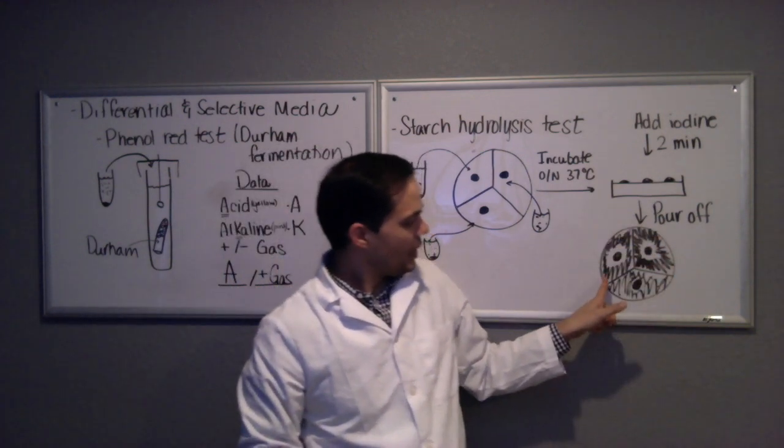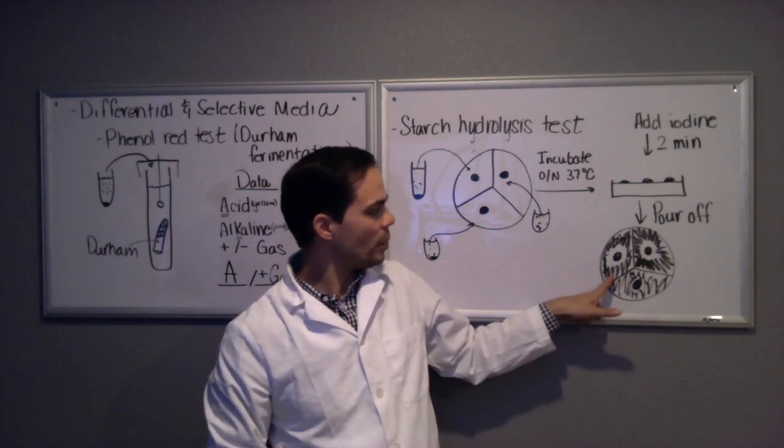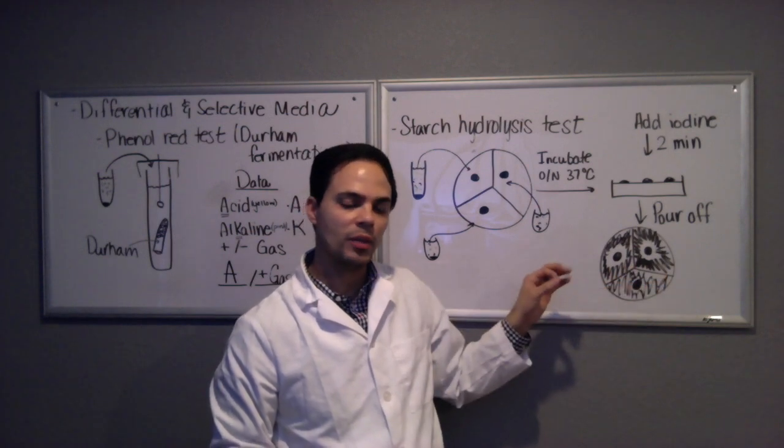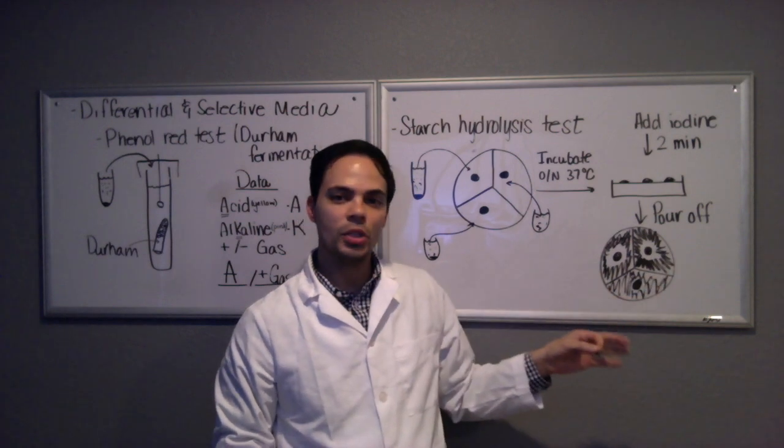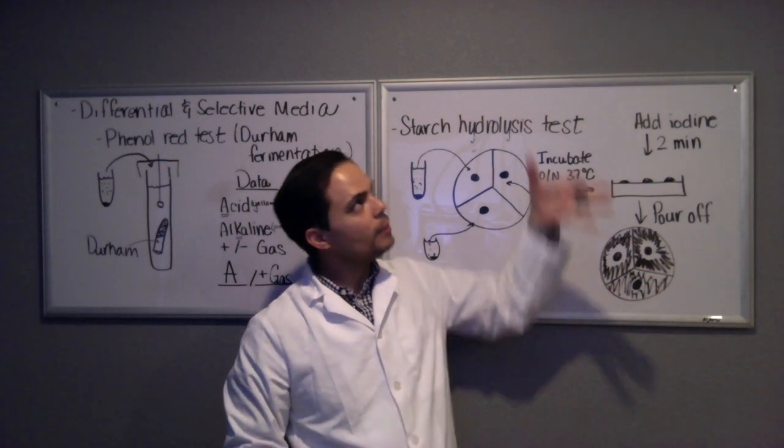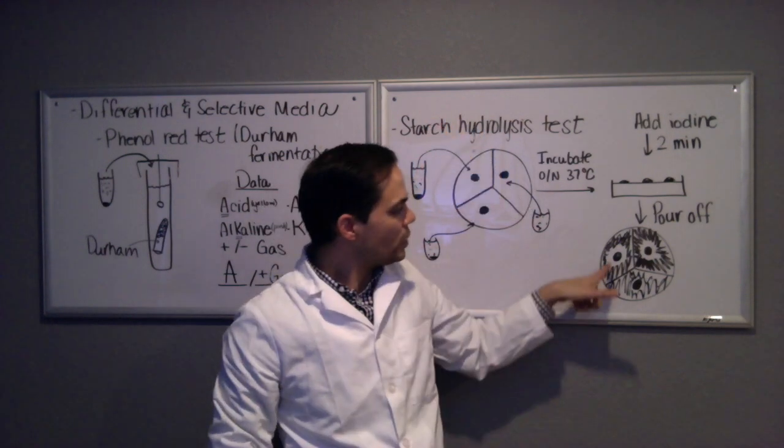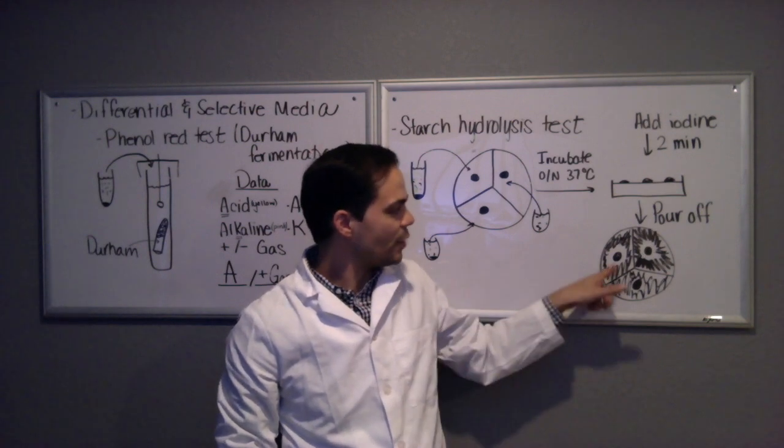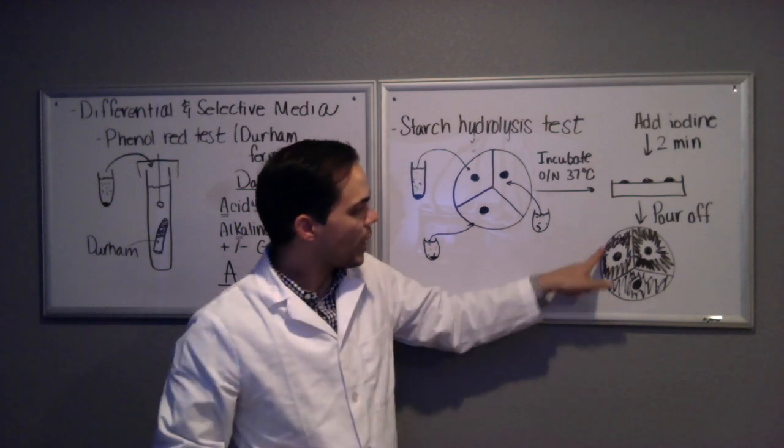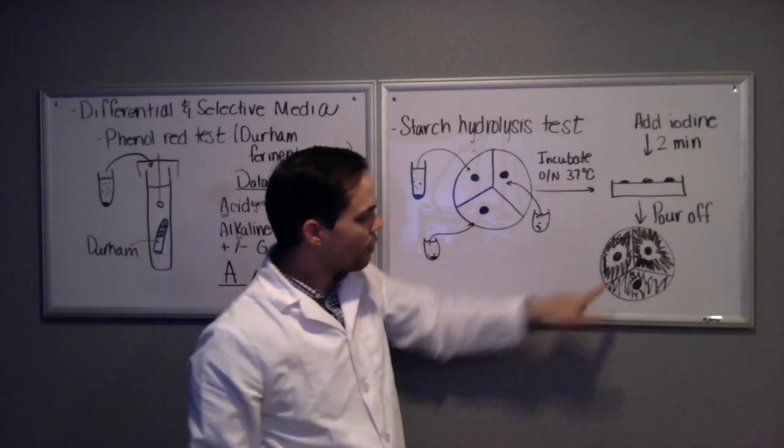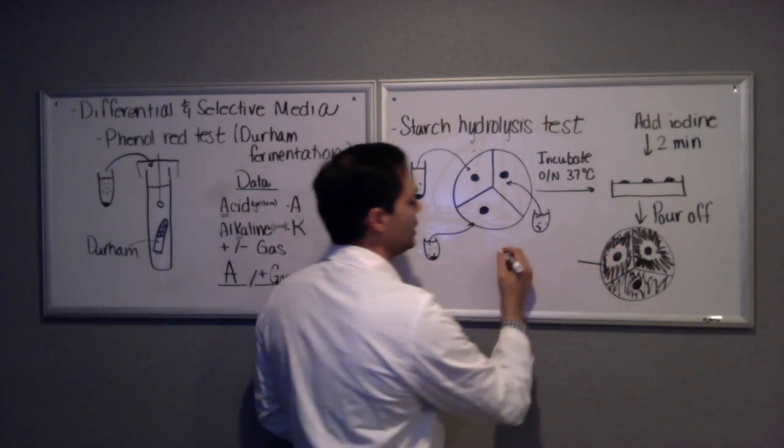Any starch that was not degraded by the bacteria or eaten up by the bacteria will appear black because iodine when it reacts with starch turns black. So anywhere on here that's black indicates that starch is present. Now if you hold the plate up to the light you'll see that there's a clearing around the actual colony, and that's indicating they're releasing exoenzymes, releasing the amylase to break down the starch in those regions. So this particular bacterium is amylase positive.